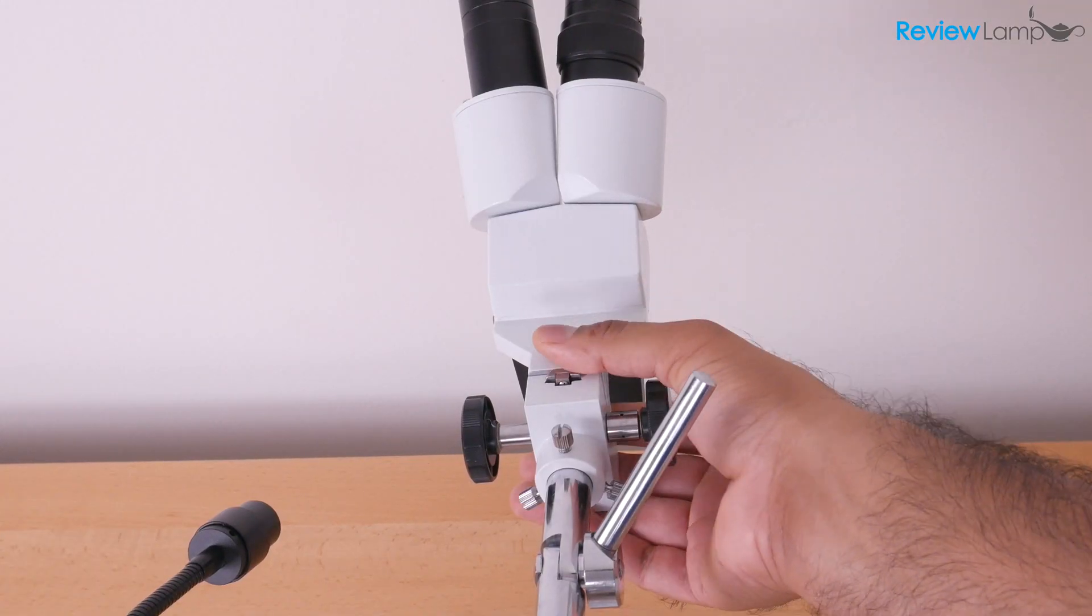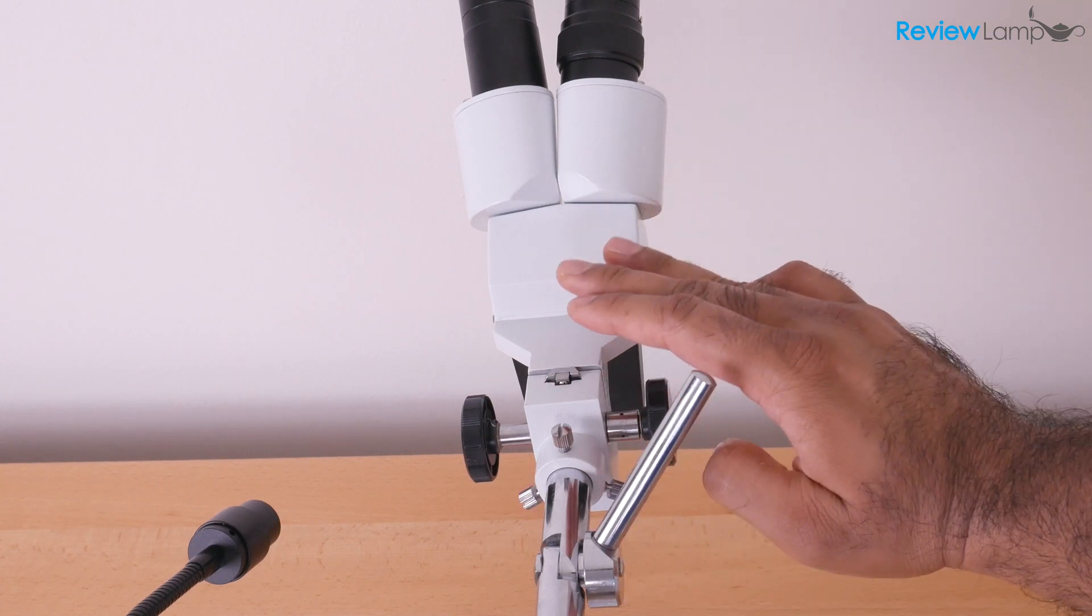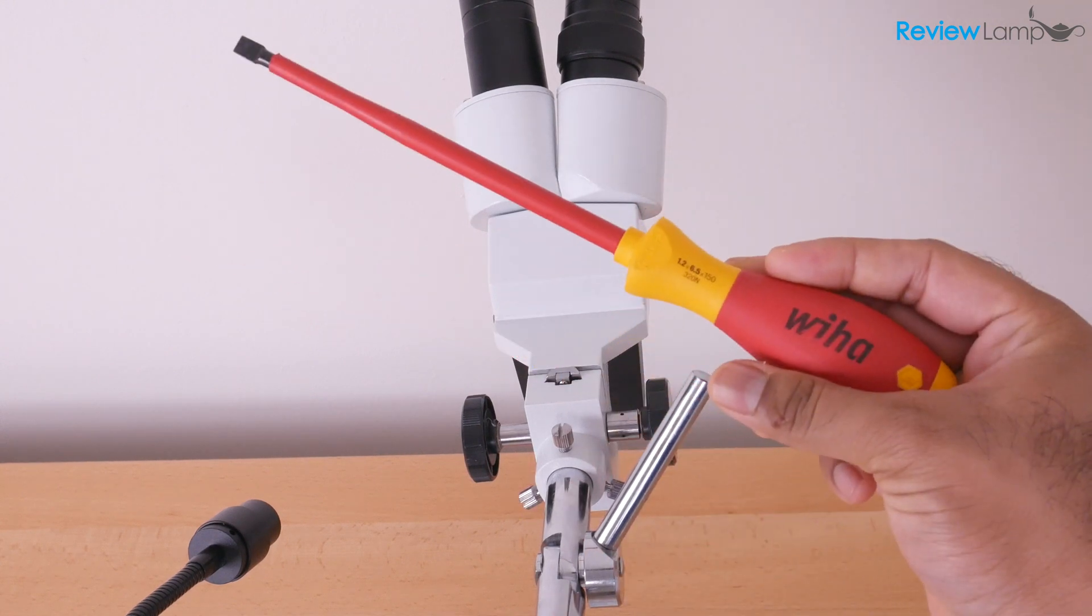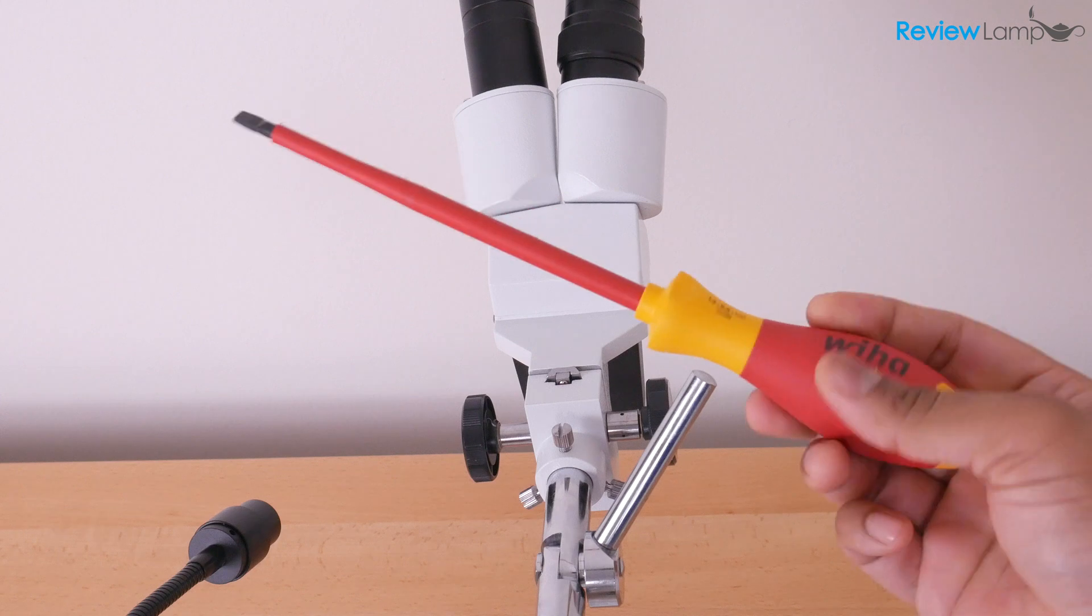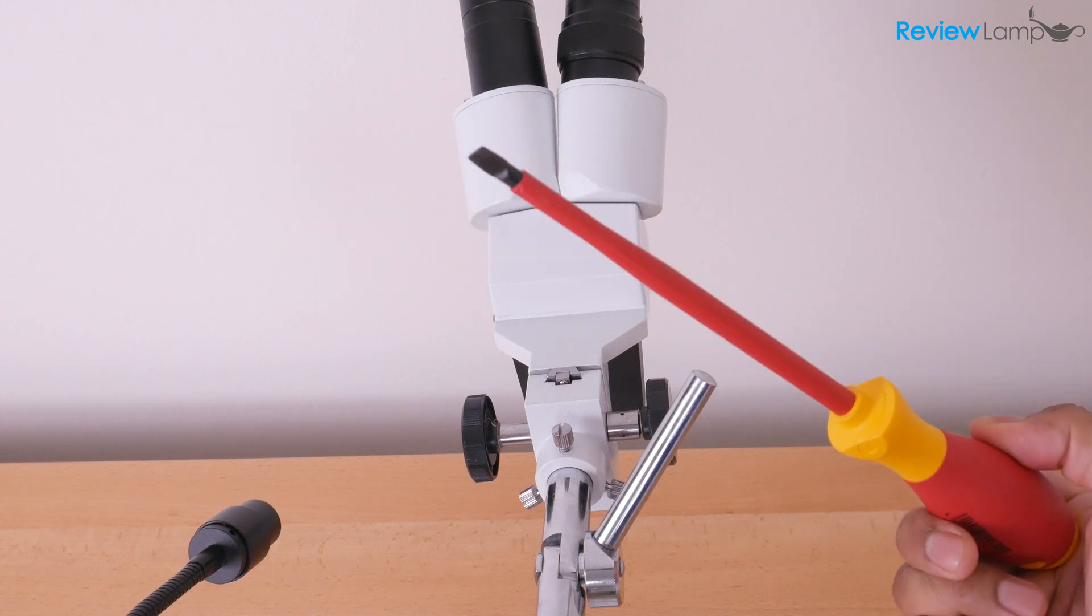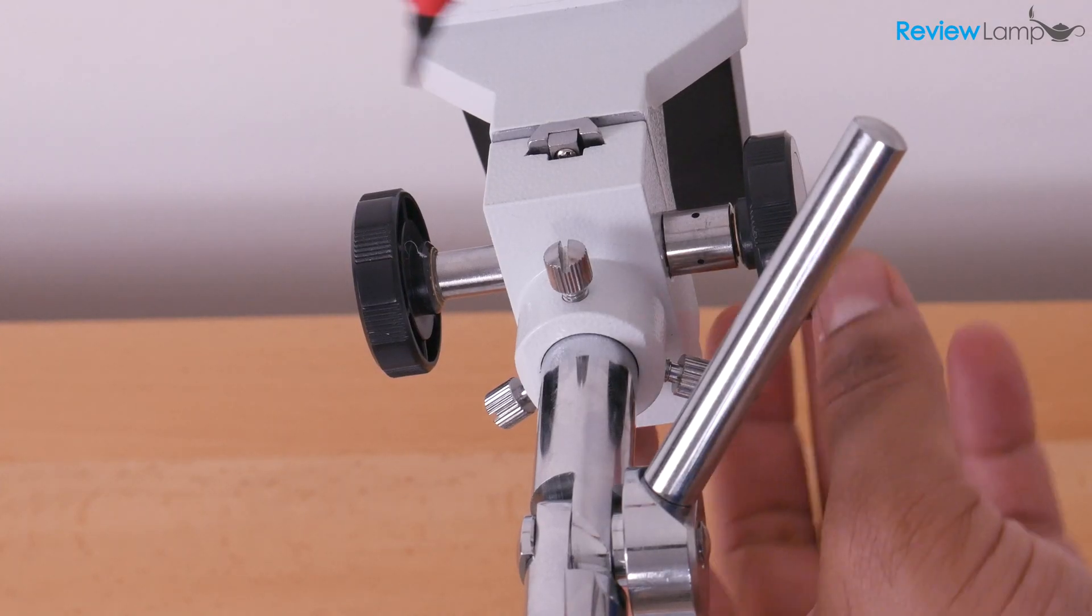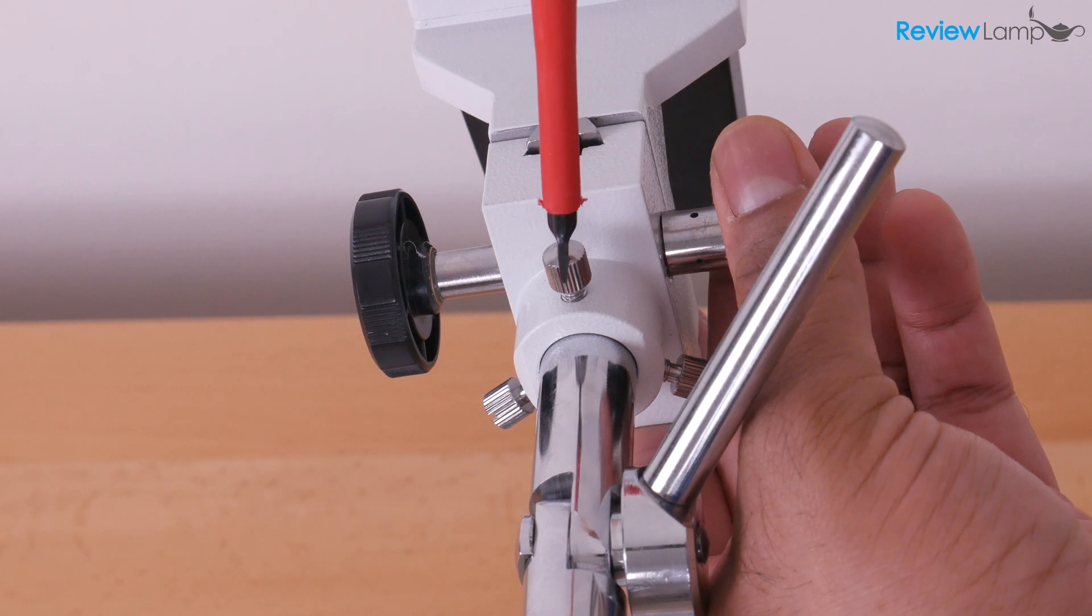And for the next step, we're going to adjust the tilt angle of the microscope head. And to do this, you're going to need a screwdriver. This is a medium sized flat screwdriver. And to do this, all you need to do is adjust the screw on top.